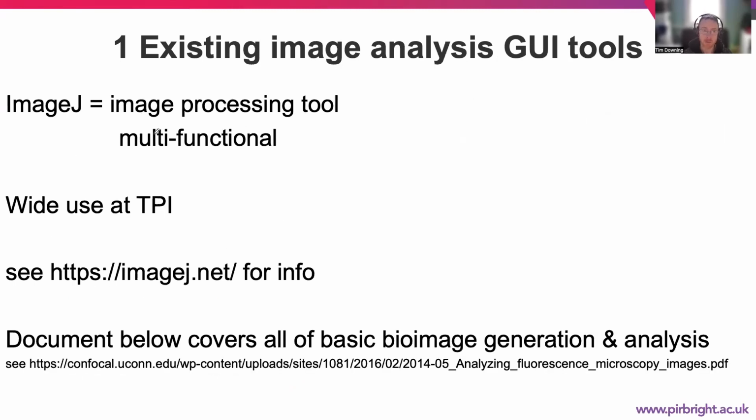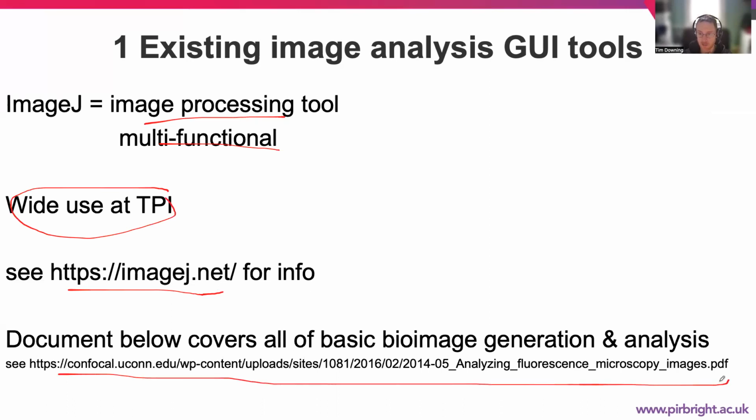There's also a tool called ImageJ, which is a general image processing tool. It's multifunctional. It is widely used at the Institute. And you can see here for more information. There's more information at this PDF link as well that covers all the basics for using ImageJ.